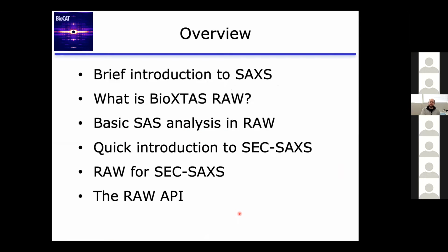So what I'm going to do, I have a couple very brief slides on SAXS so that everybody's hopefully on the same page. Then I'll talk about the program, go through some of the basics of what it can do, a quick demo, switch back and talk about SEC-SAXS and how the program can analyze that kind of data, and then do another quick demo of that and finish with a couple more slides at the end.